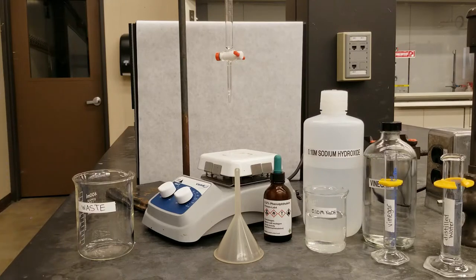In today's experiment, we'll be conducting the titration of vinegar. Now, vinegar is a mixture of acetic acid and water, and the titration will be used to determine the concentration of acetic acid in vinegar.